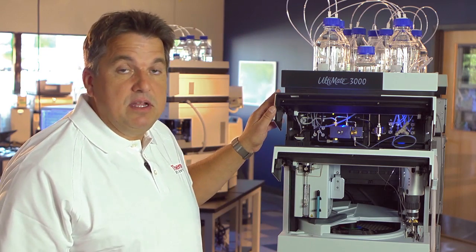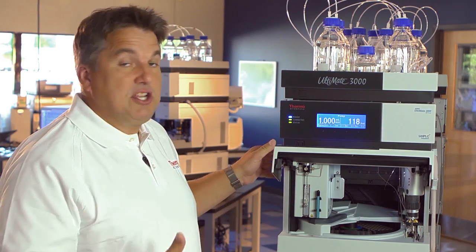That was the hardware, so let's talk now about the software and the tool we have implemented to do the transition from LC to UHPLC very fast. I'm using Thermo Scientific Chromeleon 7.1 to control the system and also do the data processing. Let me show you how easy it is to access and use our speedup tool.